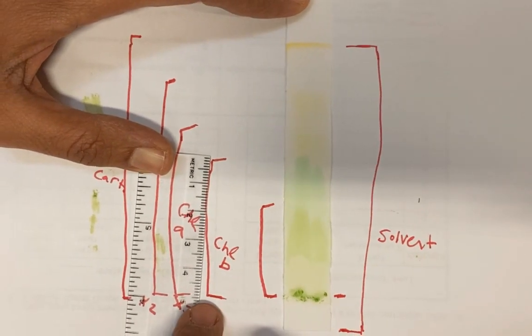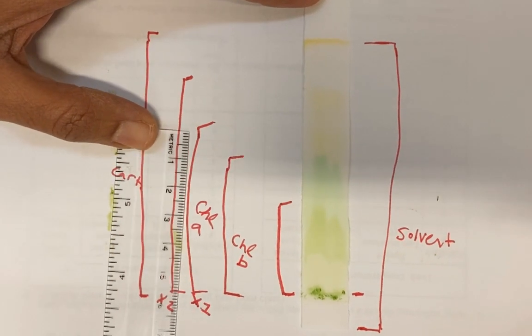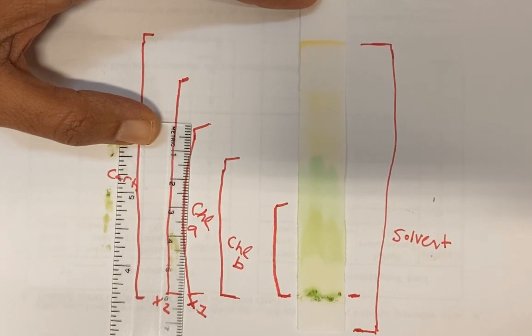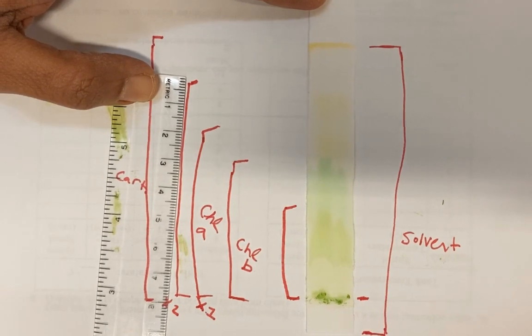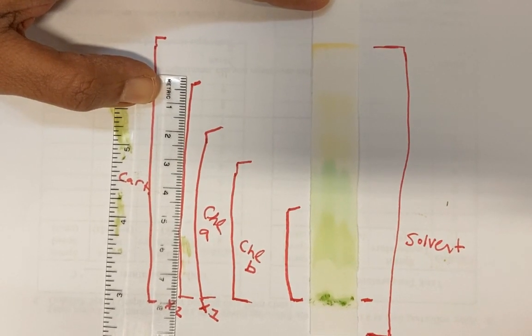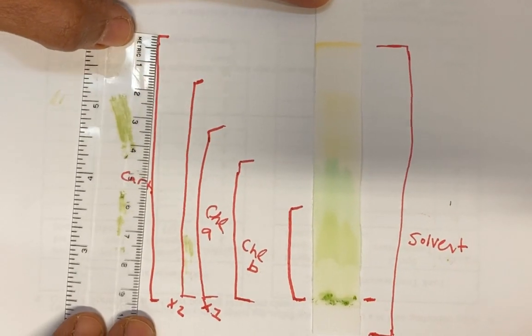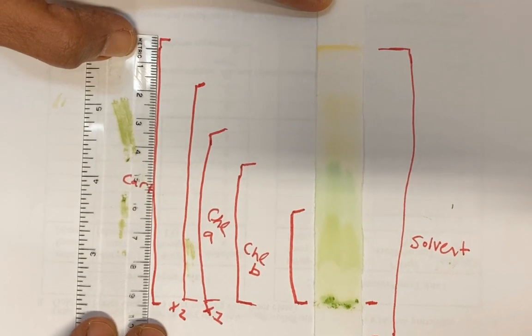Okay, and then there's your chlorophyll A. Okay, so again, up to here. There's your first xanthophyll. And there's your second xanthophyll. And lastly, your carotene.